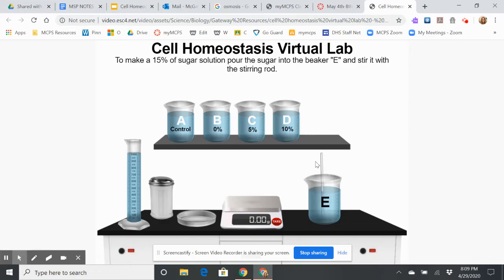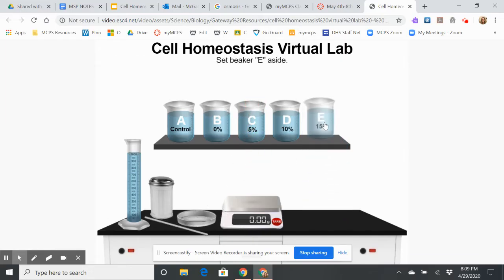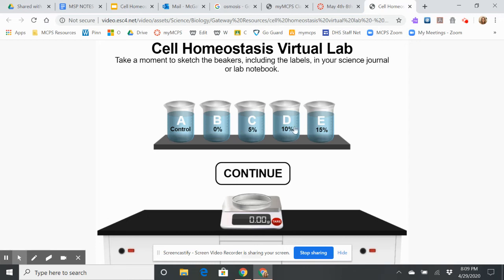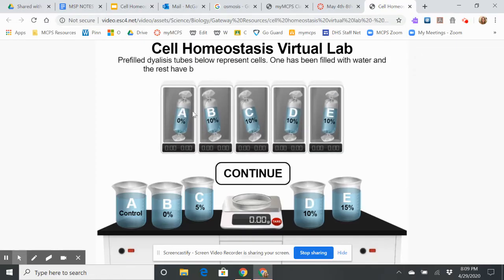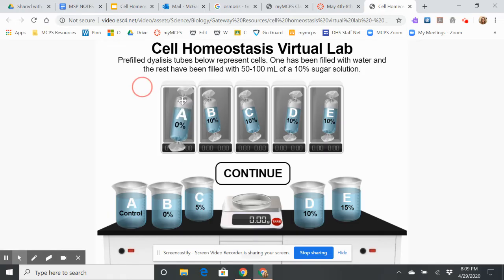Now I have these four different experimental groups. These beakers are going to represent the outside solutions that a cell is going to be placed in. The dialysis tubing is representing the cell — it's semi-permeable, meaning some things can move in and out. I'm going to place the dialysis tubes into the beakers. One has been filled with water and the rest have been filled with 50 to 100 milliliters of solution.